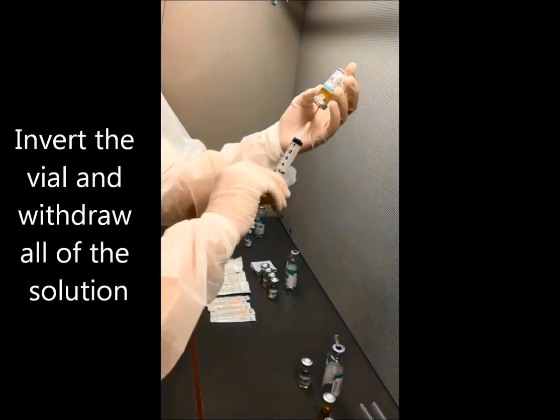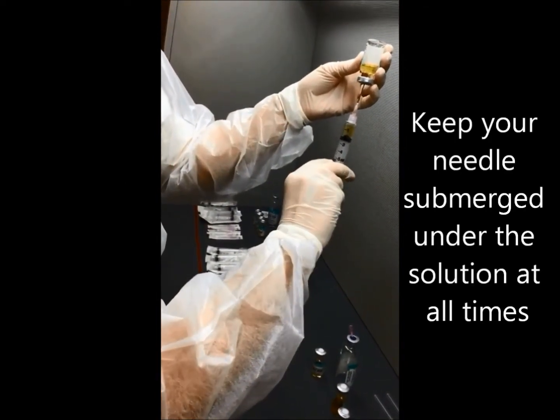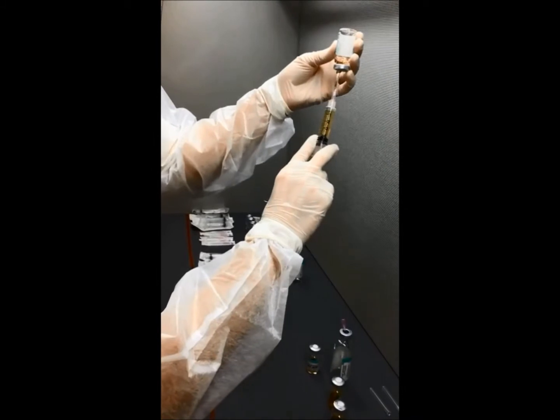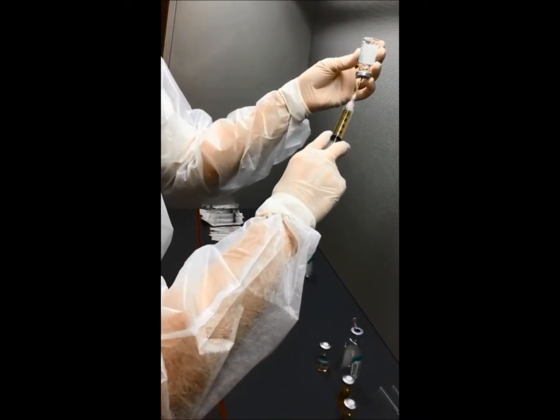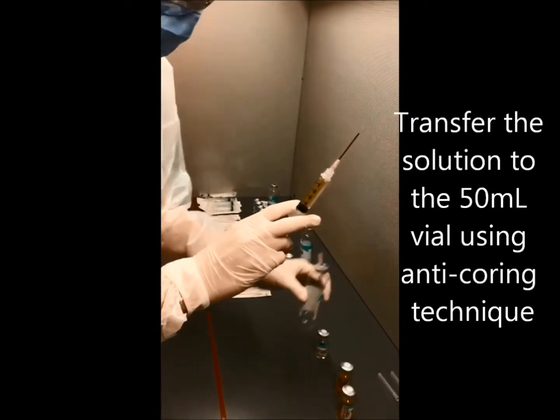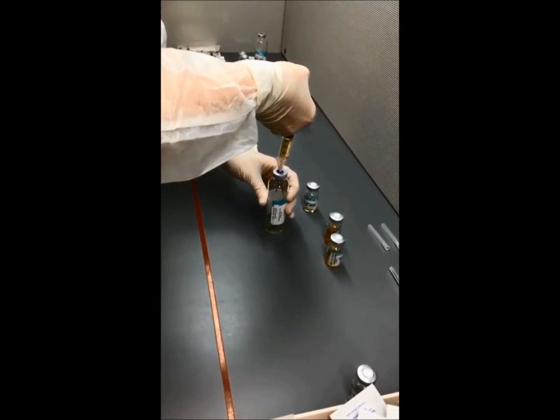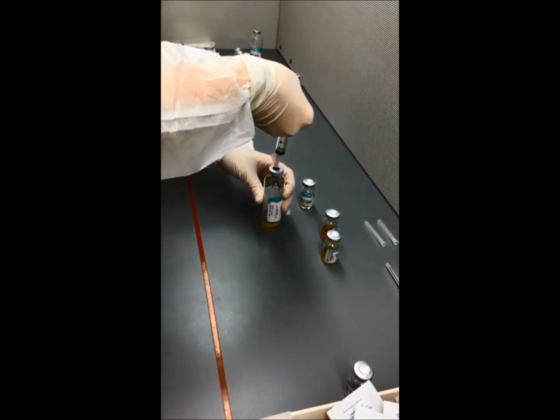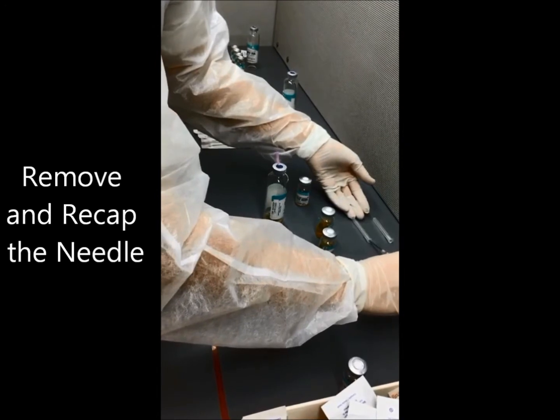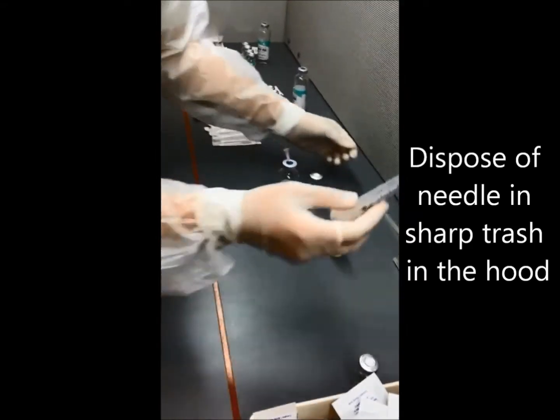Invert the vial and withdraw all of the solution. Keep your needle submerged under the solution at all times. Remove the needle and check for air bubbles. Transfer the solution to the 50ml vial using anti-coring technique. Remove and recap the needle. Dispose of the needle with needle guard and sharp trash in the hood.